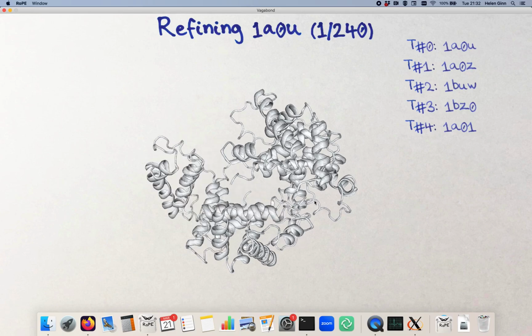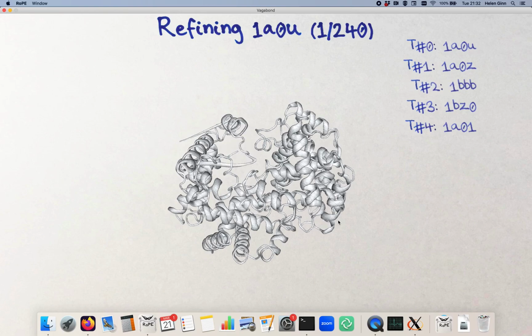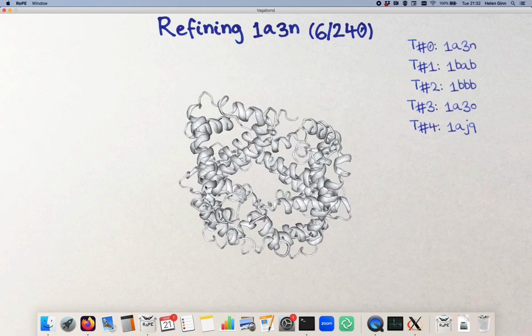This is actually not a very good estimation of where the protein chain should go, because tying up a protein from one end to the other is a recursive system. This means that any small error in the torsion angles will get propagated and send the protein chain off in the wrong direction, and this compounds on every bond that you go through.